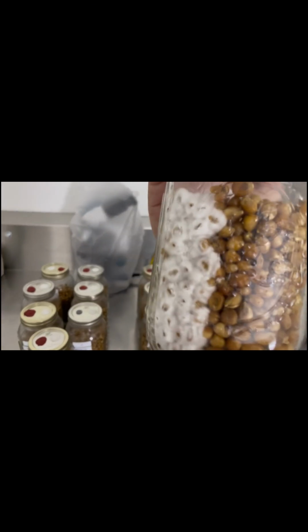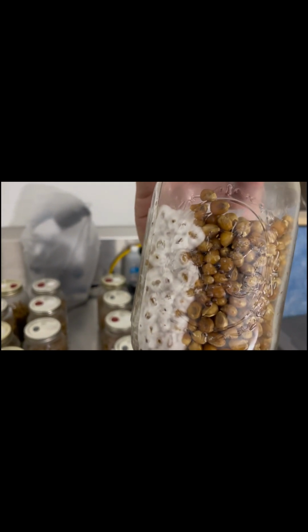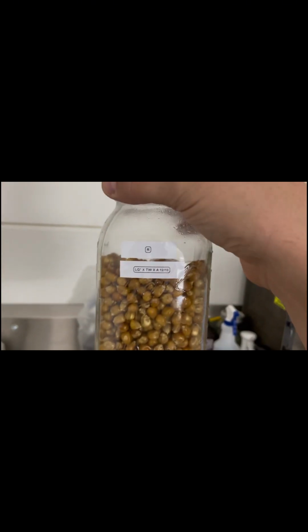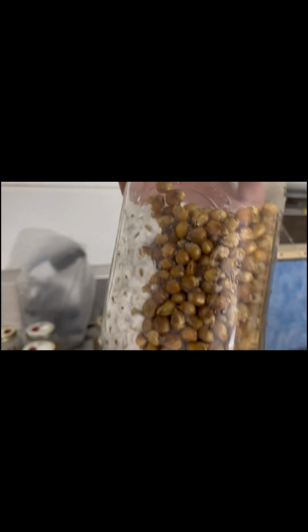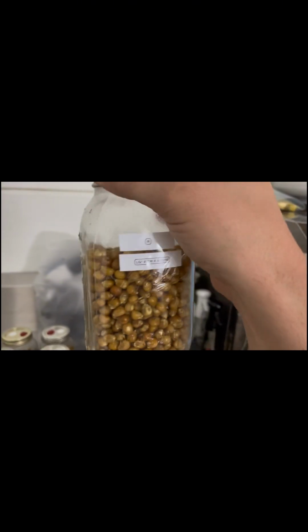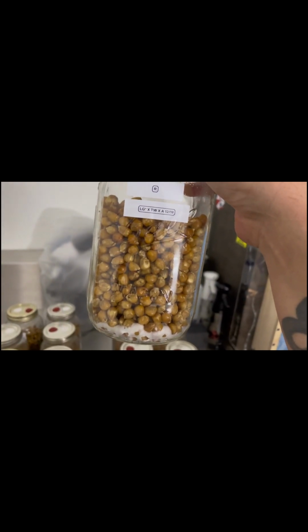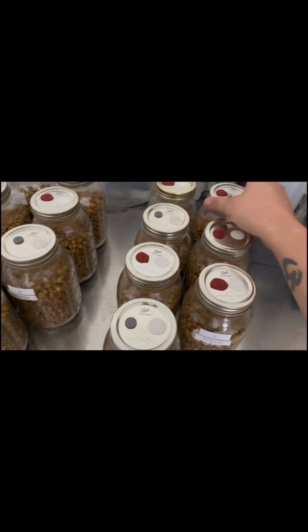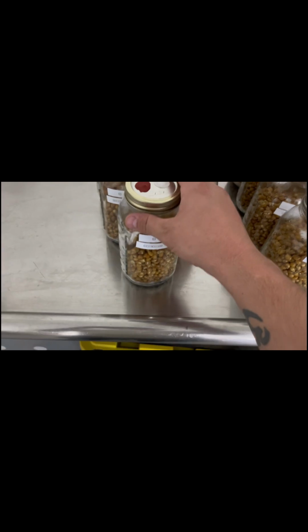I try to do it as consistent as possible. See, this one though, you can see I didn't spray it in the center. I sprayed it on the side. So it does have a lot of growth. And like I said, this is the regular corn. And so it's been exactly the same amount of time. I inoculated these all at the same time. They all got 5 cc's of liquid culture that all came from the exact same batch. I try to do everything as precise as possible. I put the same amount of corn in all the jars, weighed it all out.